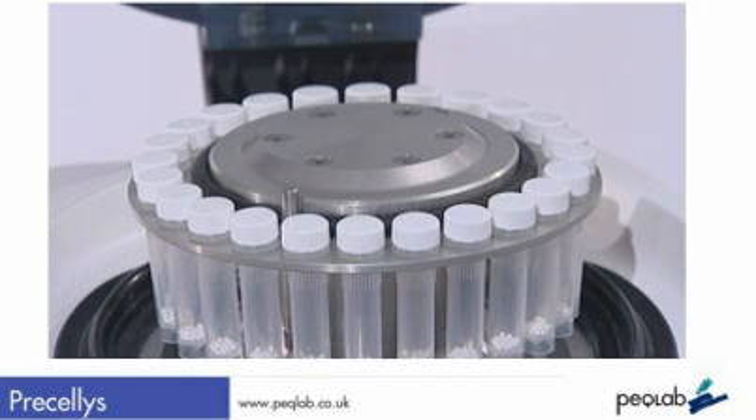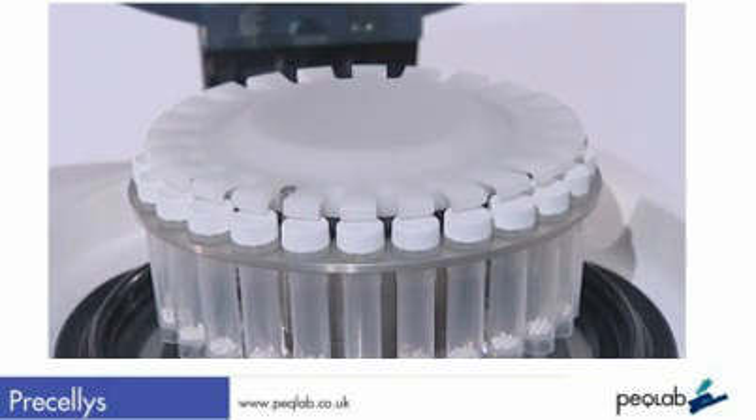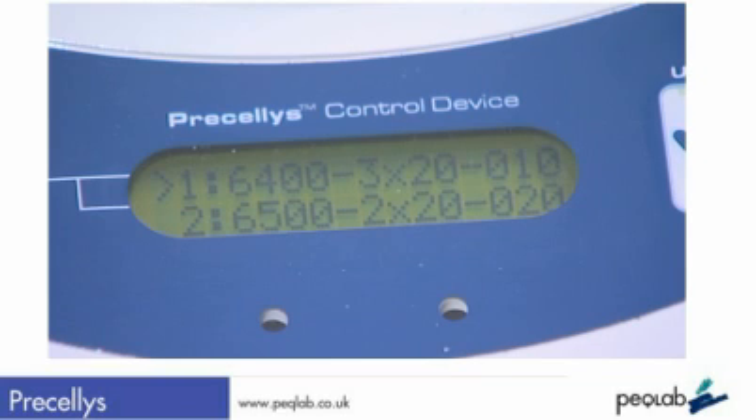The press-on lid plate is held tight by a vacuum, which also operates to confirm that the system will run safely, so the lid requires no screwing down or the use of tools, which is required in other systems. Close the lid, the safety sensor contact is established, then press go.